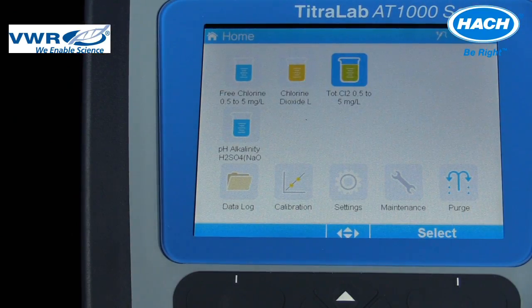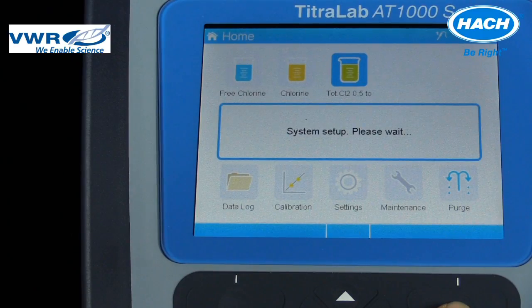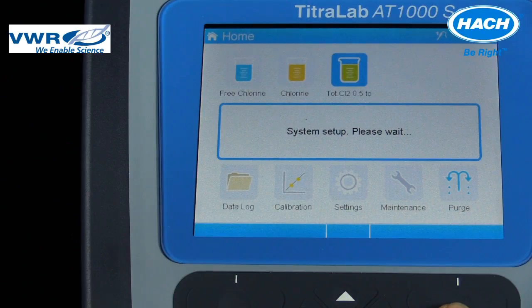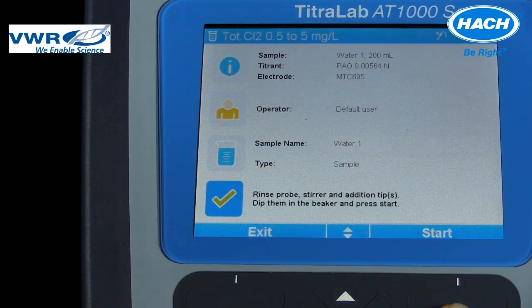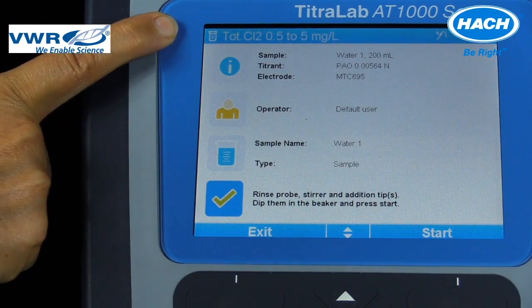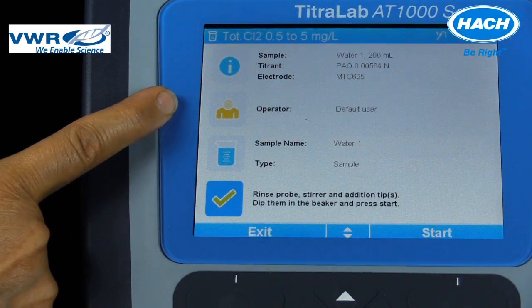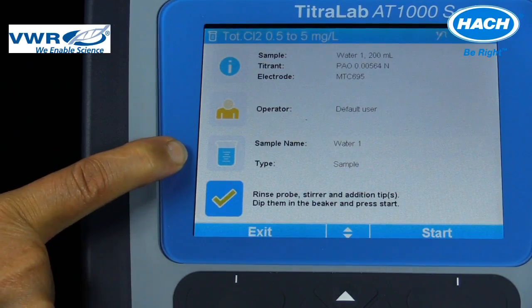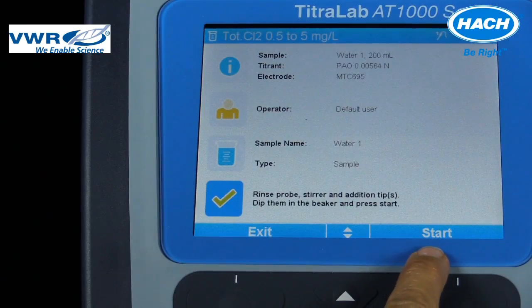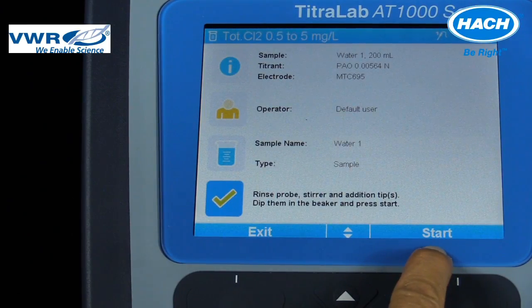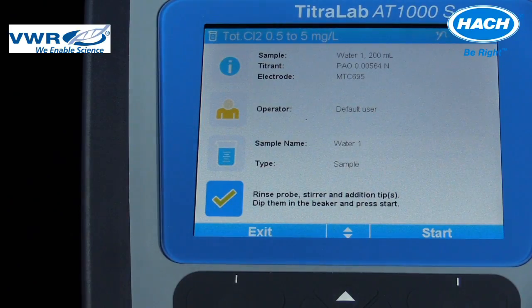To load an application, use the keypad arrows to select the desired application and then hit Select. The software will then confirm if the correct electrode to perform this procedure is installed. The instrument will display 'System setup, please wait,' then advance to the instrument settings to perform that procedure. On the methods screen, the application name is provided at the top as well as an electrode icon signifying the electrode connection is in port 1 or 2. When the application is installed, it programs the instrument to follow the application note instruction. Details provided include the sample volume, titrant solution and concentration, and the electrode sensor model. The operator, sample name, and sample type can be entered on the method screen. The check key indicates that the instrument is ready to start the titration after following a few steps and selecting Start.